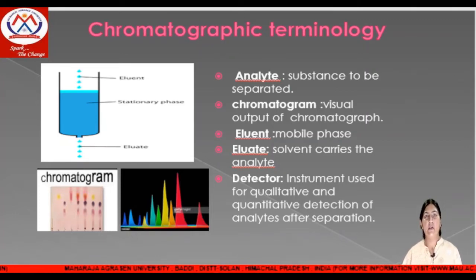Detector is basically an instrument which is used for the qualitative and quantitative detection of the analytes after separation. Here we have three figures. First represents the eluent, stationary phase and the eluates. Second is the chromatogram, and third is the result of a detector.